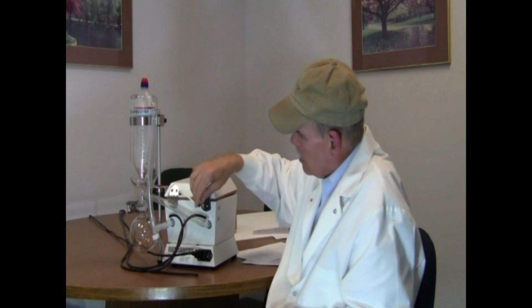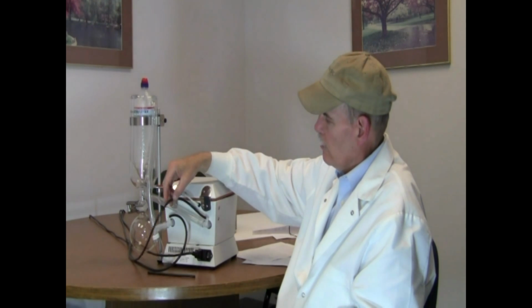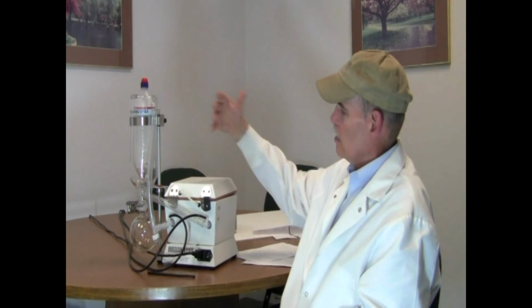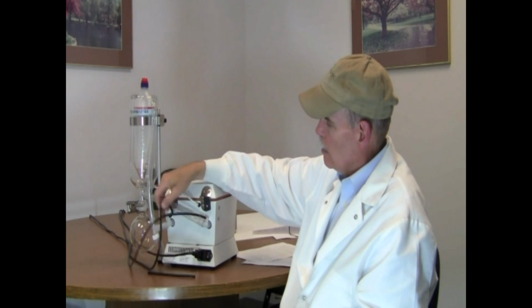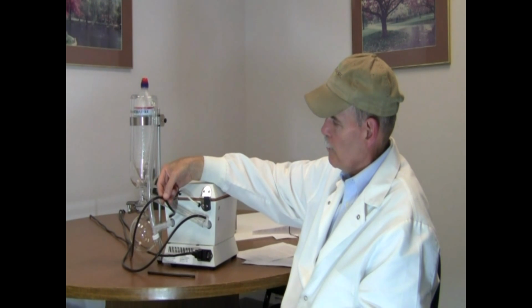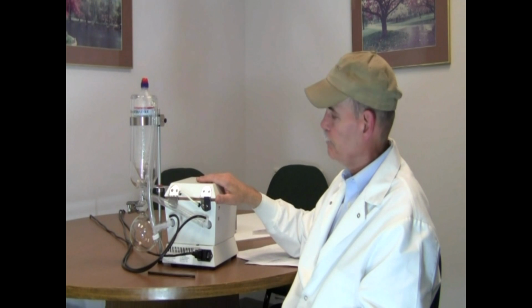elephant trunk. And by running just a bleed, a very low level of nitrogen or argon gas, you will effectively displace the oxygen that's circulating inside the device that you captured when you close the lid. And the oxygen and any overflow will pass down this exhaust tube and go to the fume hood.